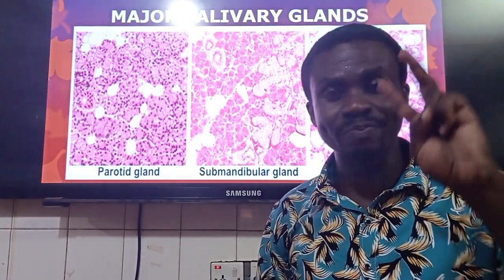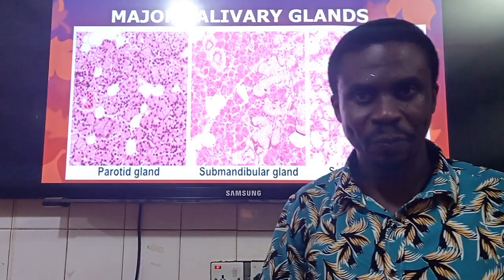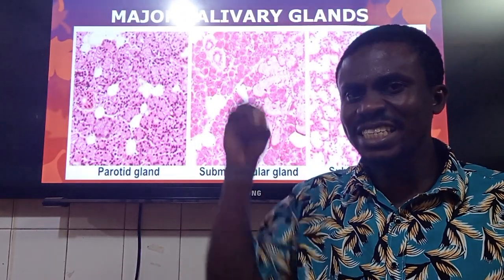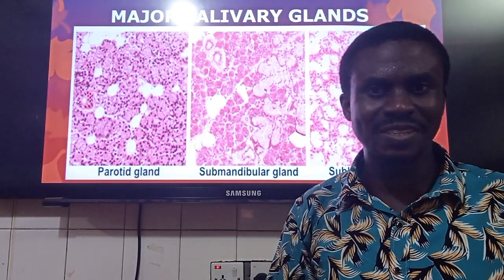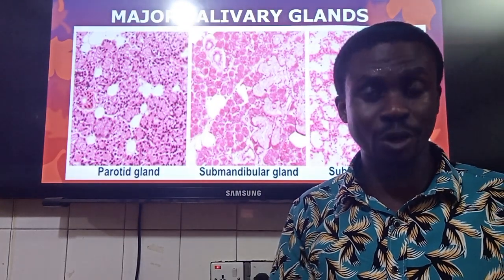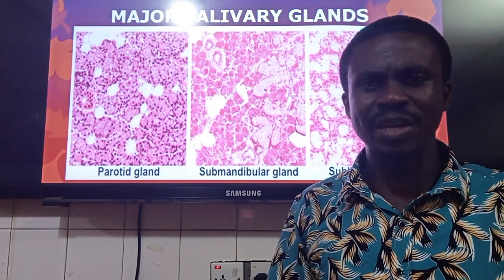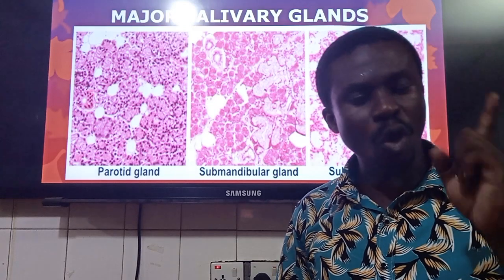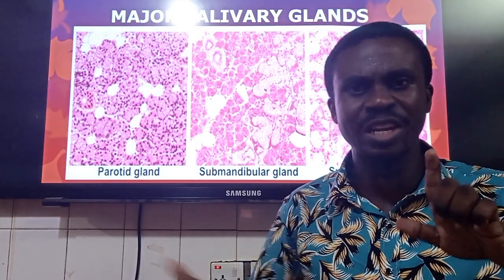So number 2 is that we'll be seeing septations. What are these septations going to do? They are going to divide the substance of these compound organs, which are actually parenchymal or solid organs, into something we call lobes in the larger picture, and then smaller lobules. So all of them will present with lobes. Histologically, we'll be appreciating them.